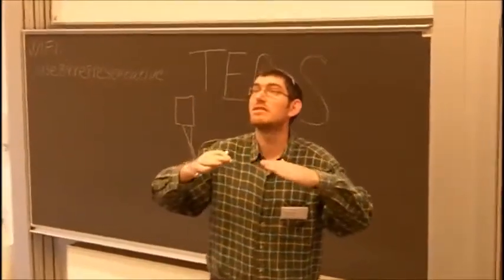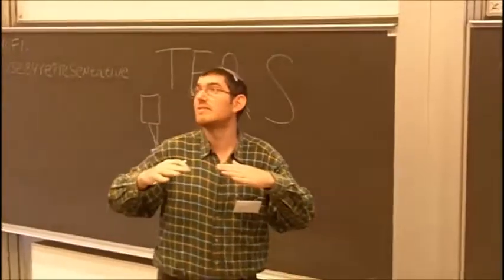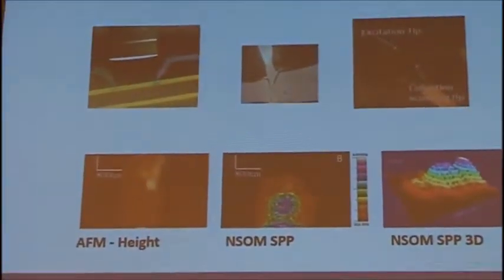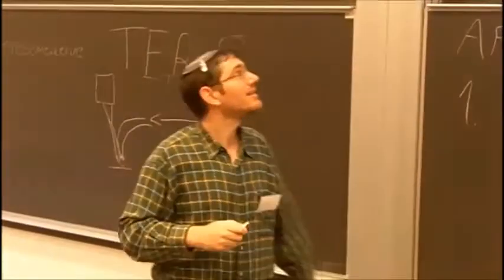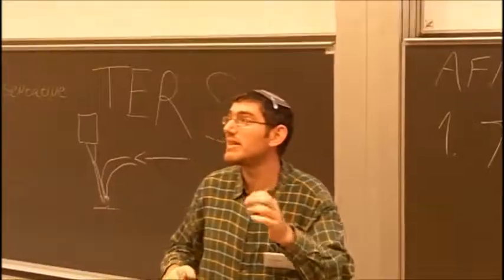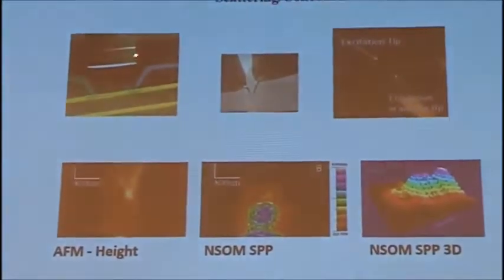That's a kind of electromagnetic near field, and it's traveling on a metallic conductor, because the plasmons travel on things that are metallic, and this probe has a small metallic particle at the end, and that's scattering those plasmons, and then we can collect them in the far field with an objective.